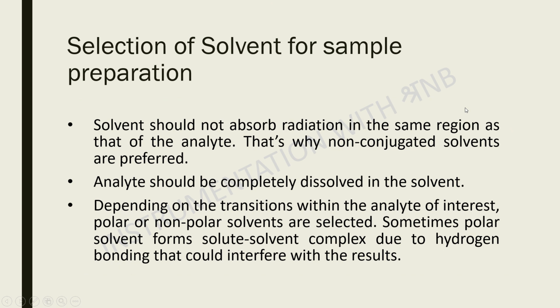Selection of solvent for sample preparation. What we have to keep in mind while choosing a solvent for sample preparation. Firstly, it should not absorb radiation in the same region as that of the analyte so as to avoid overlapping. That is the reason why non-conjugated solvents or saturated solvents are preferred.